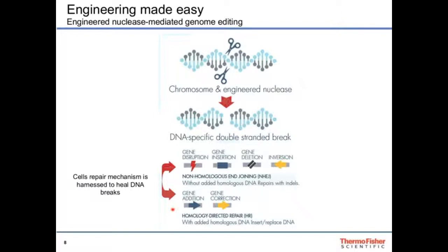So that allows us not only to make the plasmids easier to create our inserts, but we can actually synthesize these donor DNAs and use double-stranded DNA, or actually use single-stranded oligos to do this repair very efficiently. So that allows a lot of versatility in creating our donor plasmids. And again, I mentioned that we and others are working on making this pathway more efficient.